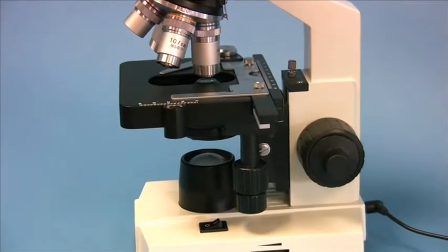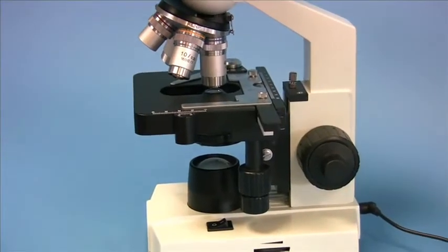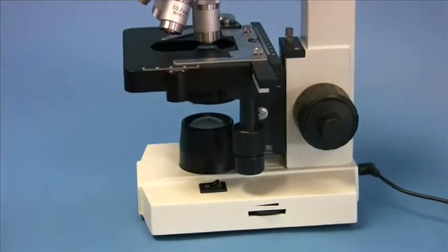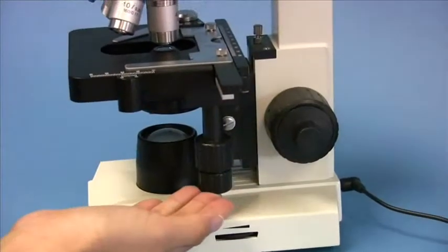In comparison with the single layer stage, the double layer has its adjustment knobs placed at the most convenient place for its users, that is, on the right hand side under the stage.